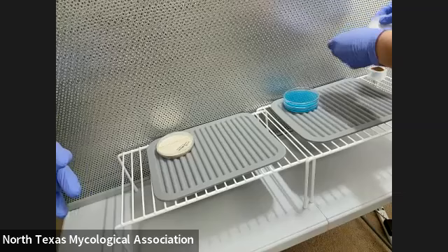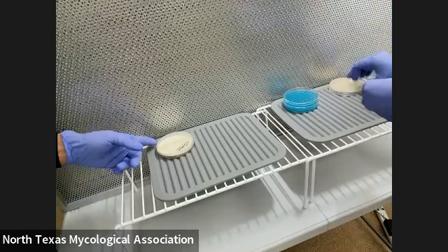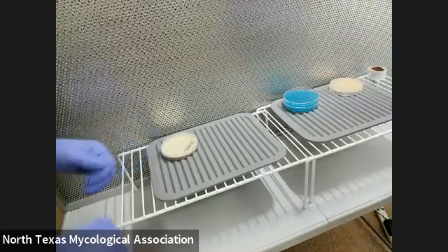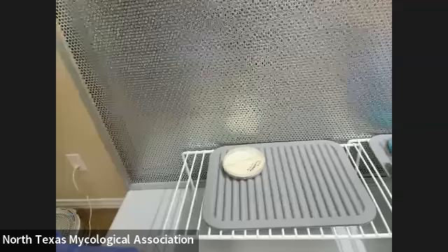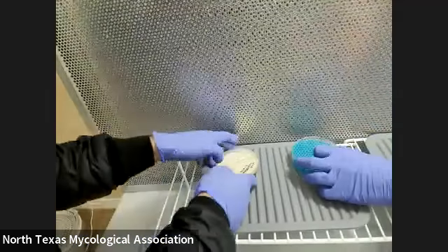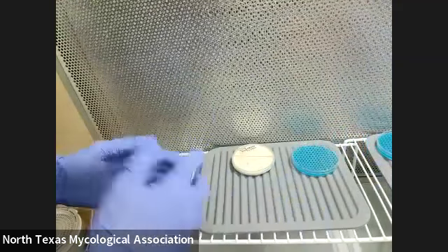Have you done agar-to-agar transfers before? Yeah, so you know how to do it. Is this the wild game? This is a wild Ganoderma right here, and this is an agar plate.